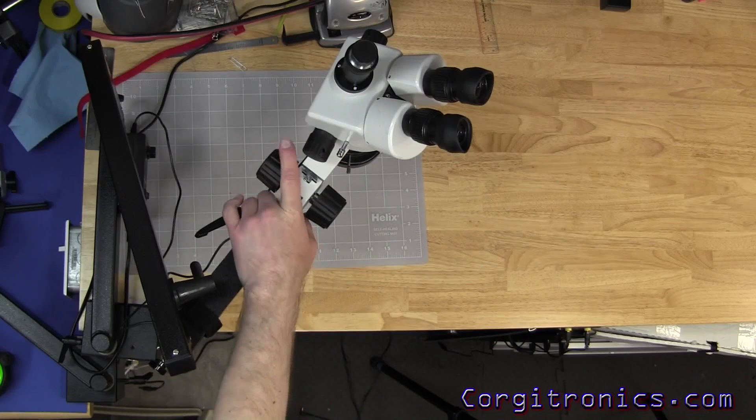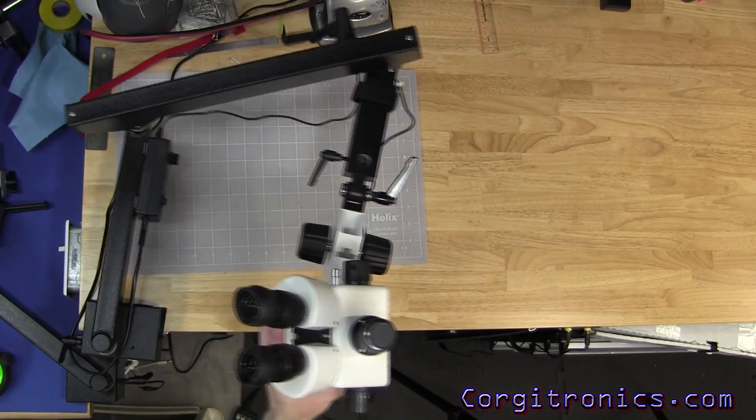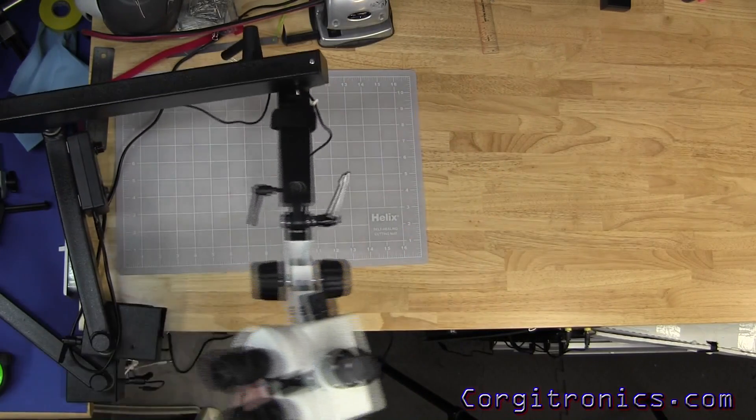Here's a quick overhead shot of the arm moving around. As you can see, it moves quite smoothly with a pretty good range of motion.